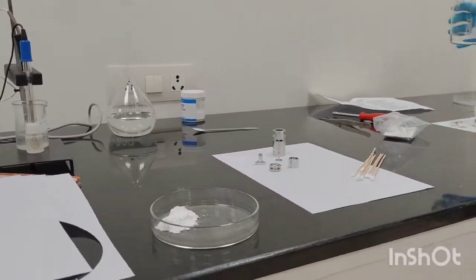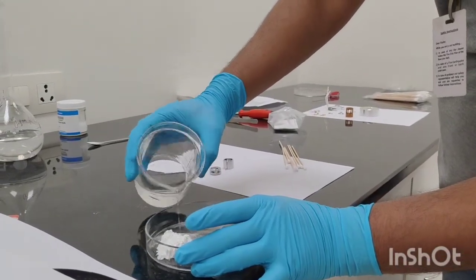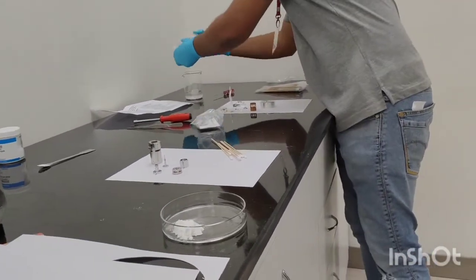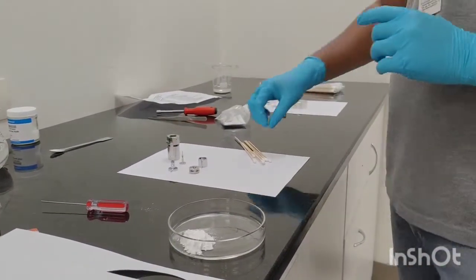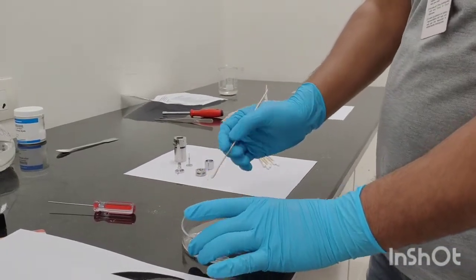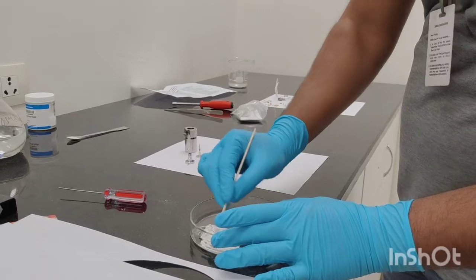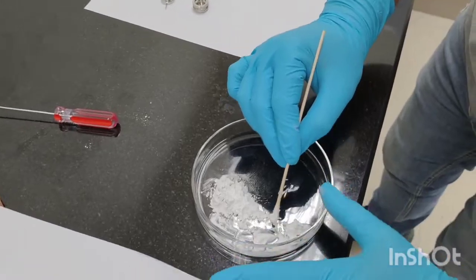Now we need to make a paste out of this aluminum oxide powder, so I am pouring a small quantity of HPLC GC-grade acetone — you can use methanol also instead of acetone, and some people also use water, but preferably I would recommend acetone or methanol so it evaporates very easily. Just make a small amount of paste and keep the rest of the powder as is.